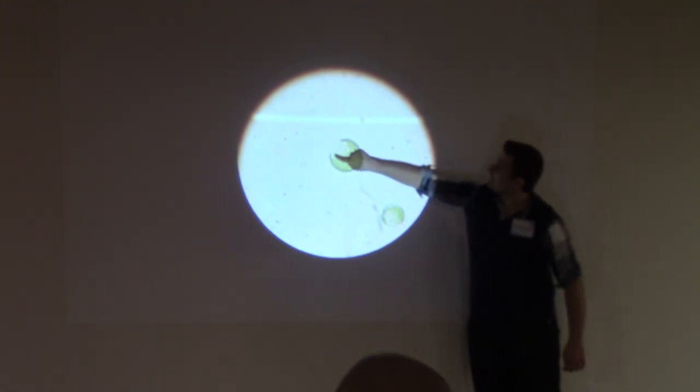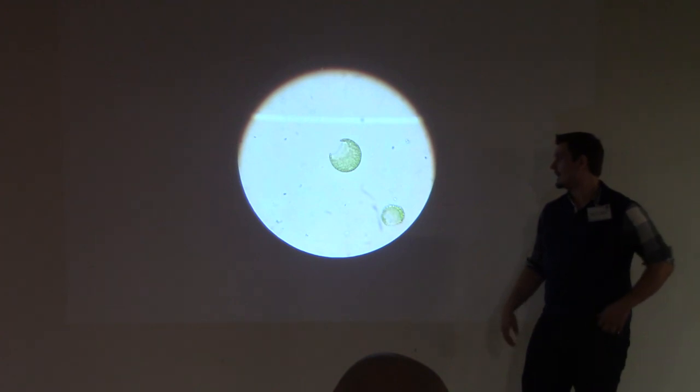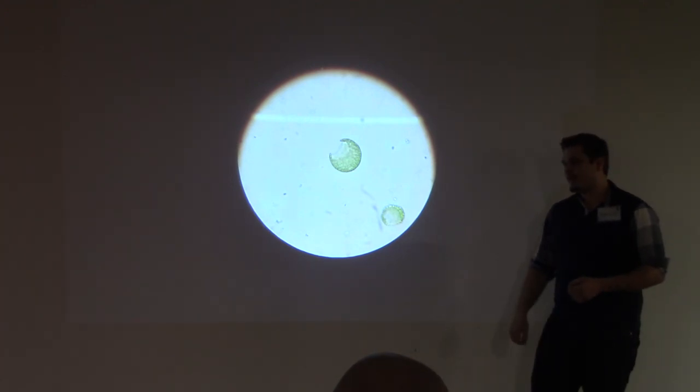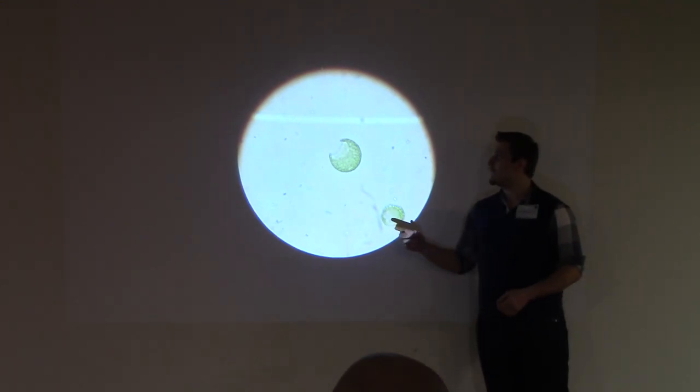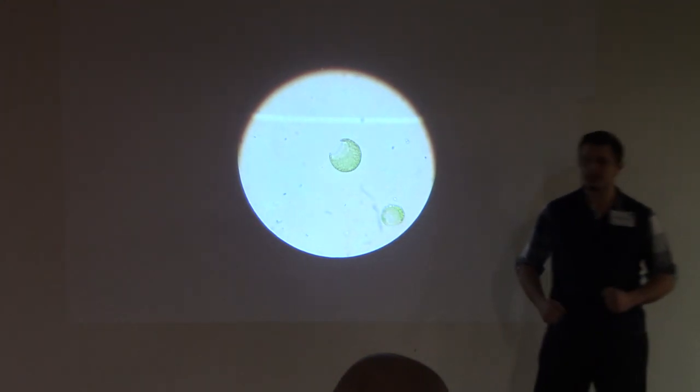But what's really cool is that right here, that's the plasma membrane. So you can visibly see the plasma membrane. It's an interesting proof that it's there. Everyone knows that it's there. People do patch clamp experiments and stuff. But here's a really nice image that you can do at home by just spinning them too fast. You can literally see it, which is really fun.